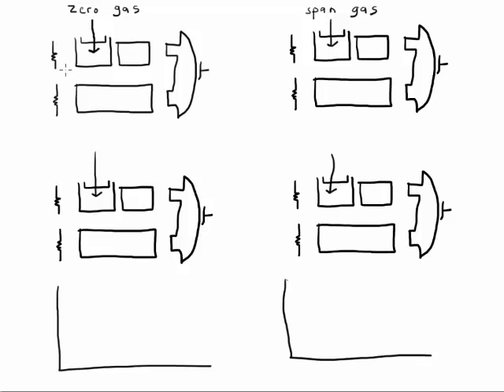The next thing we're going to draw is the chopper. So the upper portion of the page is going to have the signal open to the reference cell. So the light path is going to go through the detector from the reference. And the bottom part of the page is going to have it from the sample cell, and that's going to be for both sides of the page.